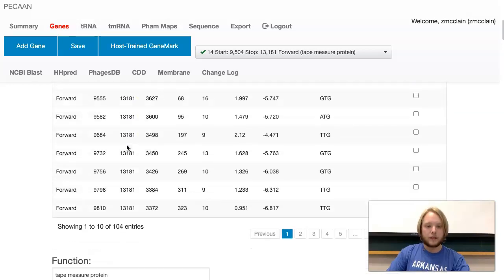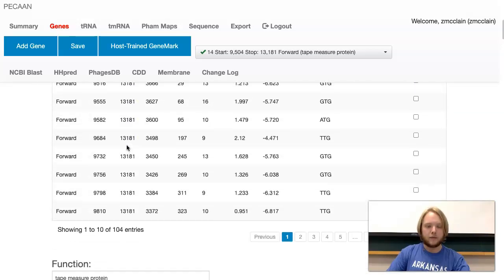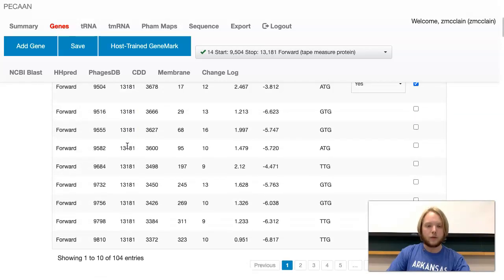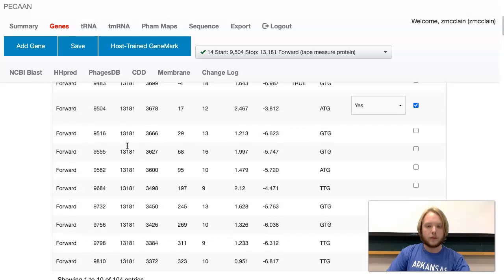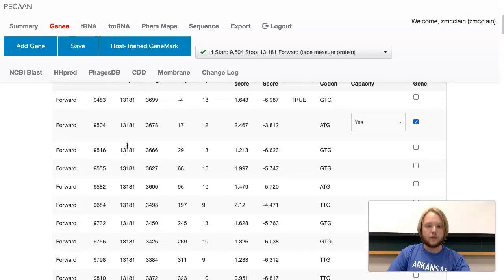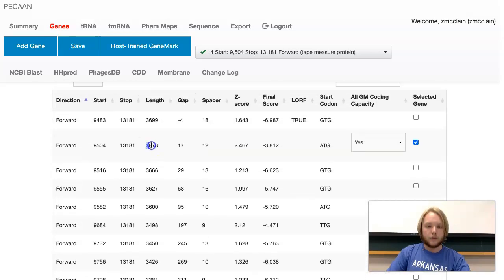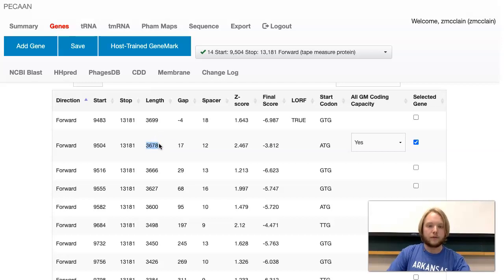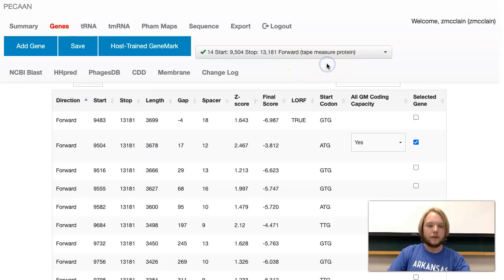This is because, as I said before, stop codons can only stop a gene. They serve no other function. This length number is the amount of base pairs long this gene is. This is the tape measure protein, and the tape measure protein is the longest protein in any bacteriophage.